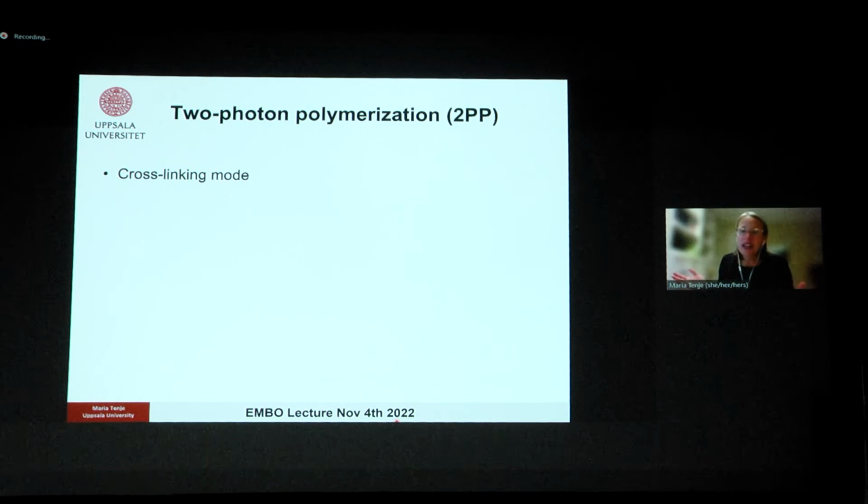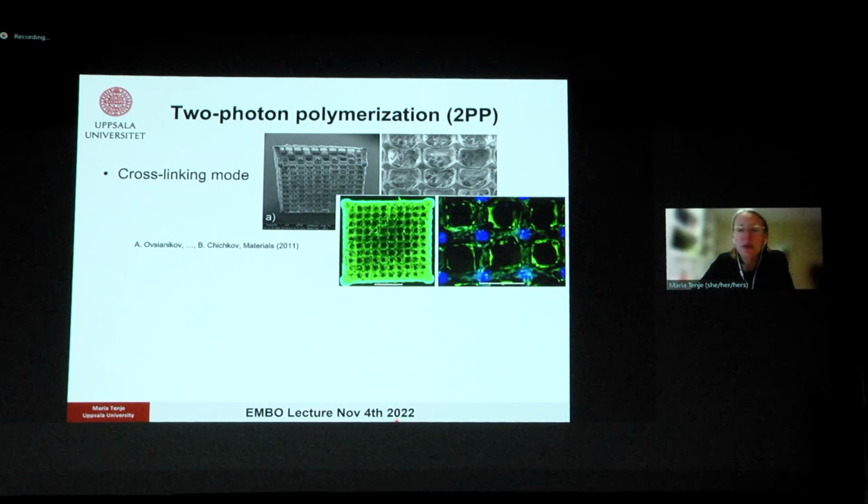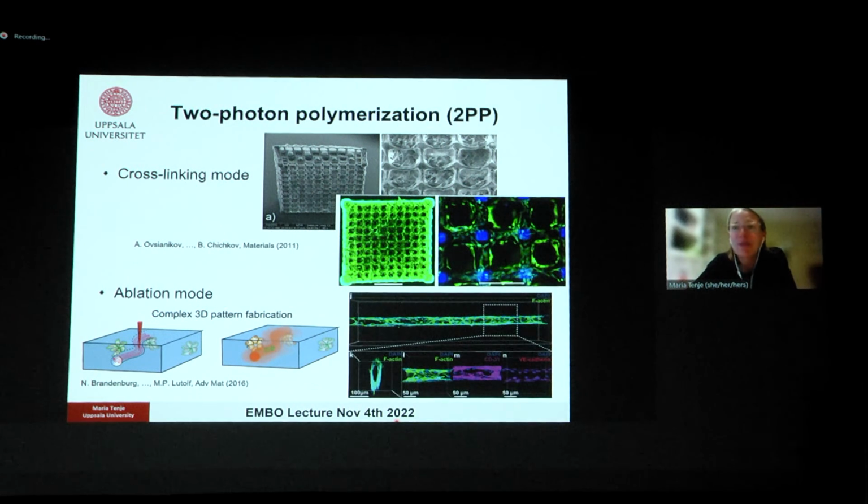And just like you can do UV light exposure either in a negative or positive approach to either form structures or remove structures, you can use two-photon polymerization to cross-link hydrogels. Here they're written as scaffolds, and then the encapsulated cells in these scaffolds could grow. Or you can use the technique in ablation. So simply have a hydrogel with cells inside, come in with your laser and write the structures that you want to have. For example, a vessel structure where the cells can grow, just on the dimensions of a microvasculature.